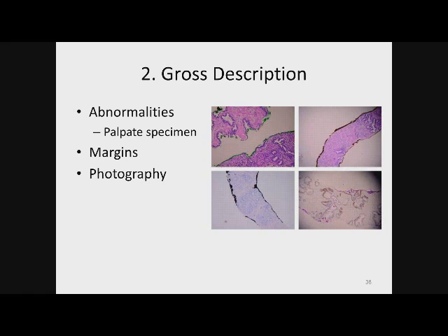The margins should be inked, and again, here you see some images of inked margins as they appear to the pathologist when they're looking at the microscopic slide. And the importance, of course, of inking the margins is to make sure that the pathologic process is completely contained. Again, for complicated specimens, photography is oftentimes included.